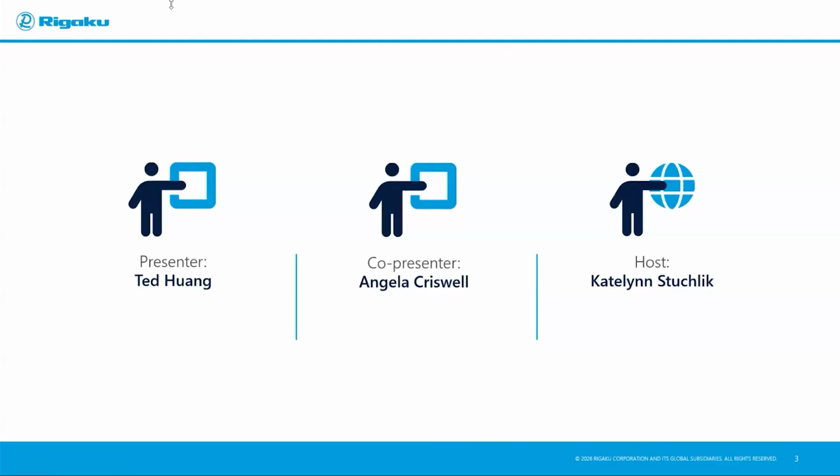Thank you all for attending Rigaku's webinar series, X-ray Computed Tomography for Materials in Life Science. In this episode, Multiscale Structural Analysis with X-ray CT, we will cover how different CT approaches can work together to improve the way materials are evaluated, verified, and refined.